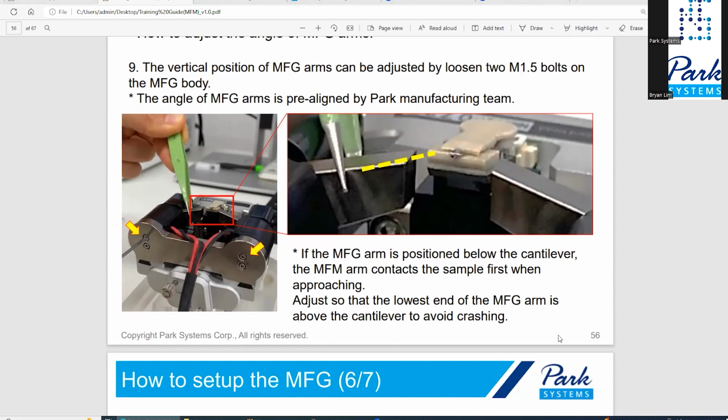What maximum size your sample? So for my sample, for this, I'm going to show my video. It depends on this sample stage can accommodate up to 150 mm, or we can have, sorry, do you mean is a scan size? If the scan size, we can scan up to 100 microns. 100 microns is the maximum scan size that we can scan on the AFM.